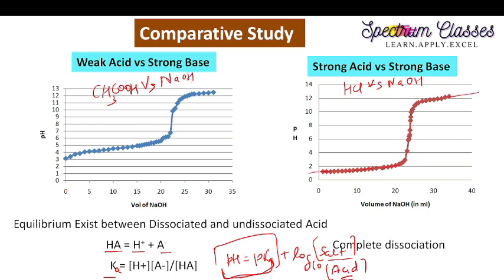But here, what is the observation? The observation over here is this: initially it increases rapidly, right? However, here we have constant change. The second point: this increases gradually, and this part actually shows the formation of salt.